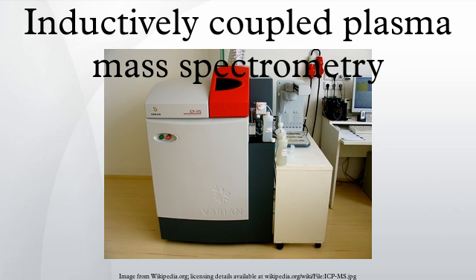least 2-3 orders of magnitude more sensitive than other mass spectrometry-based quantification methods. By introducing several MeCAT labels to a biomolecule and further optimization of LC-ICP-MS, detection limits in the zeptomol range are within the realm of possibility. By using different lanthanides, MeCAT multiplexing can be used for pharmacokinetics of proteins and peptides or the analysis of the differential expression of proteins, for example in biological fluids.